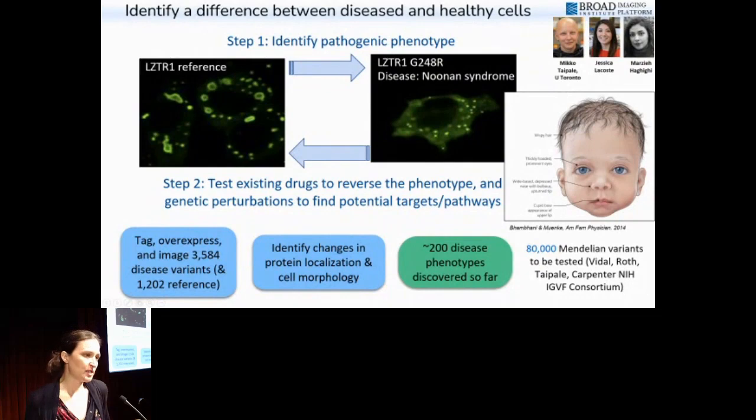Yes, this is super, and I should point that out. It's super simple microscopy. Anybody with a microscope that has a reasonable filter set can set it up to take images like this. So you can do this experiment, the cell painting assay, in small scale. And yes, there's no fancy spectral imaging or anything like that happening here. They're really just the organic dyes that you buy from a commercial vendor and add to the cells, and then use filter cubes to separate them.